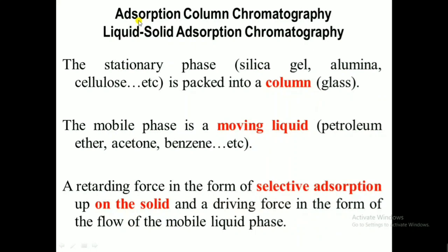One of the media should be a solid medium. So here the stationary phase will be solid, and in this particular example, the mobile phase is a liquid. So first we are going to see what is liquid solid adsorption column chromatography.